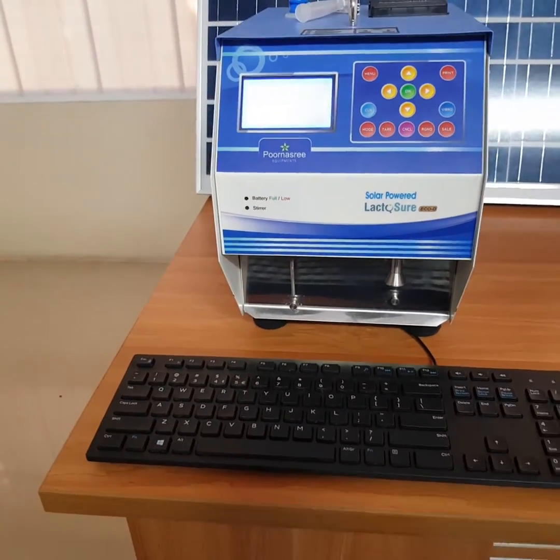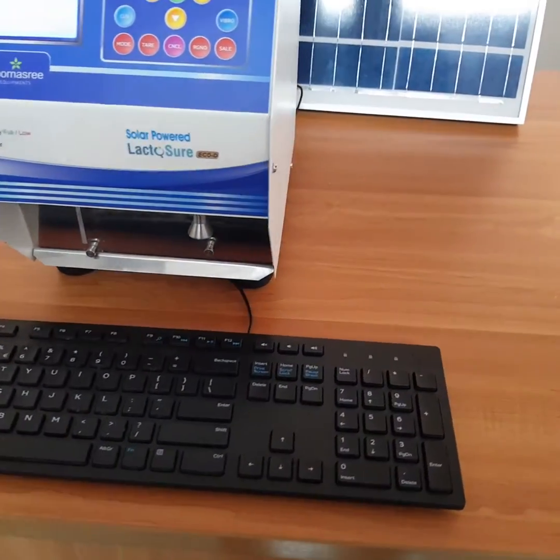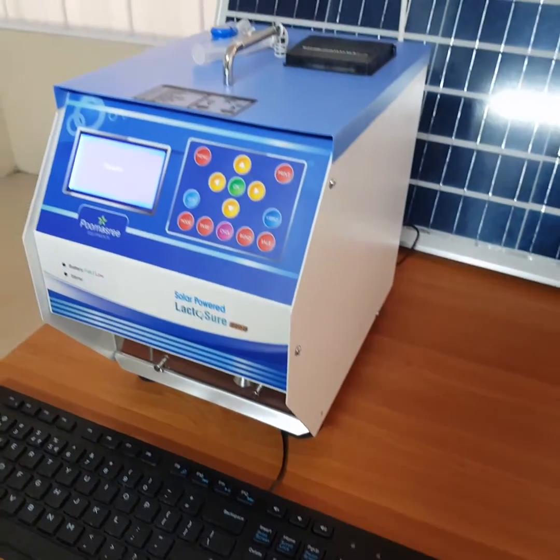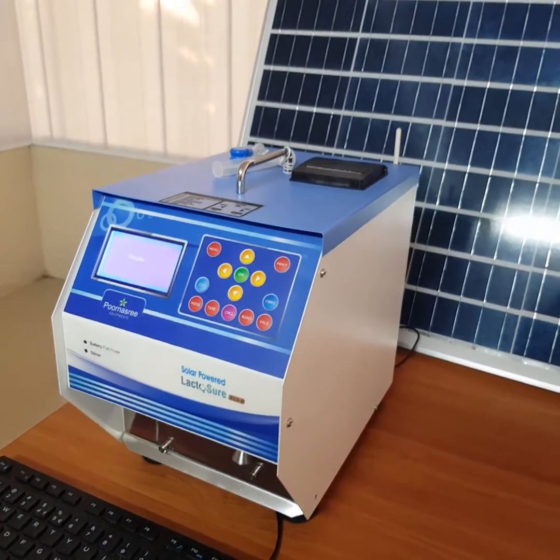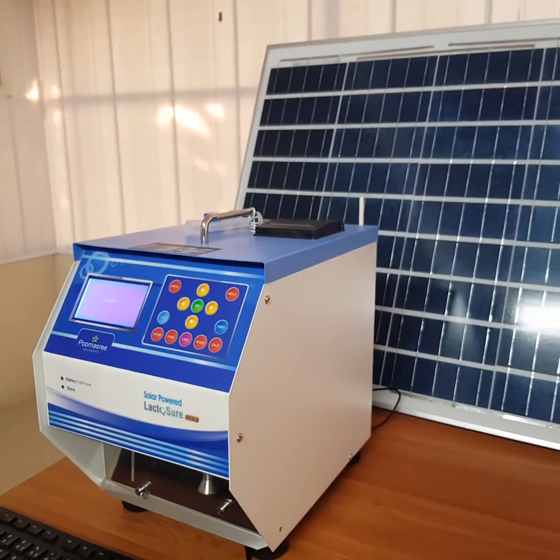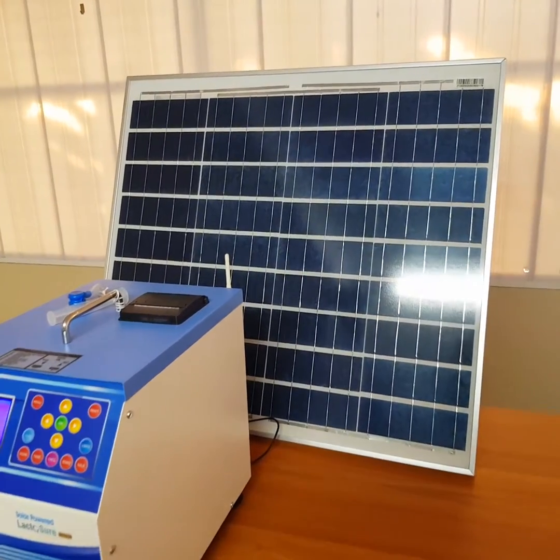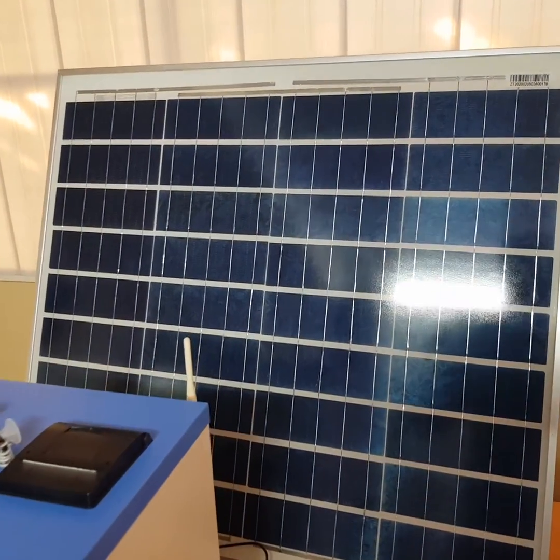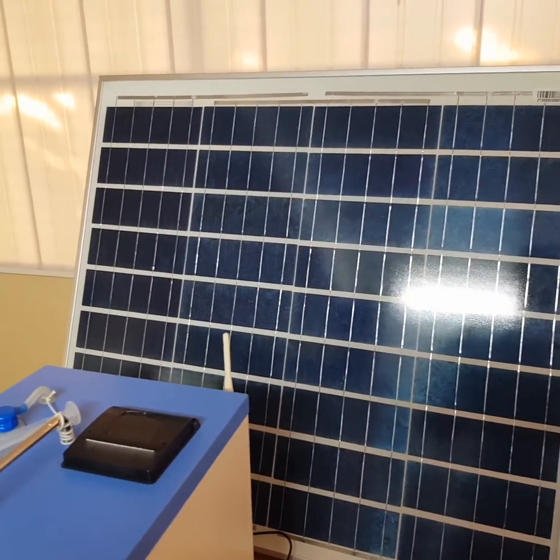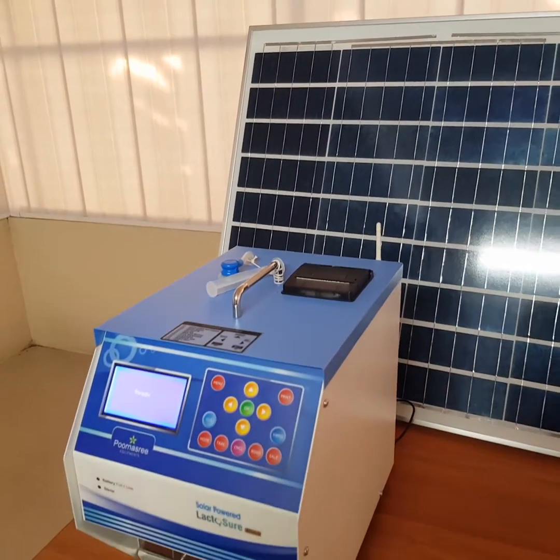Major problems with foreign-made milk analyzers are that either they are fully manufactured abroad or their sub-assemblies are assembled in India. Due to which, for any sort of major repair, Indian customers are dependent on foreign manufacturers. This is not only costly but very time consuming also.